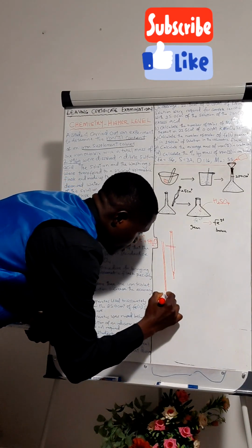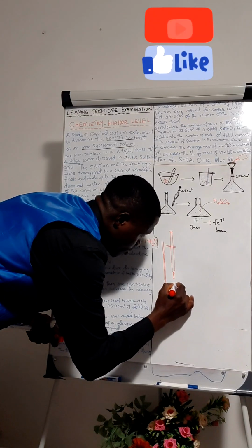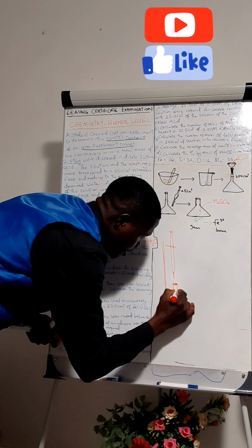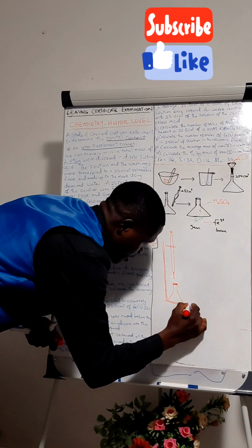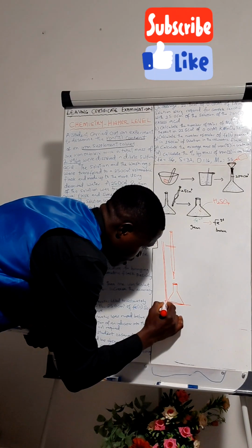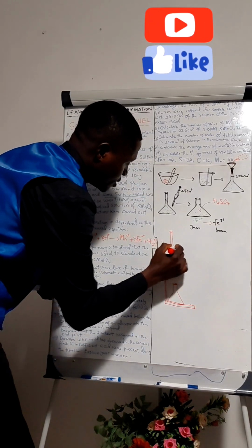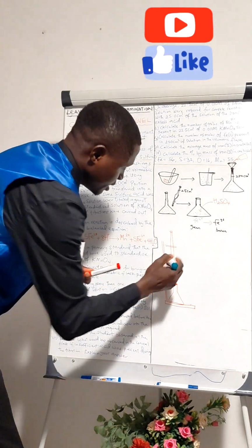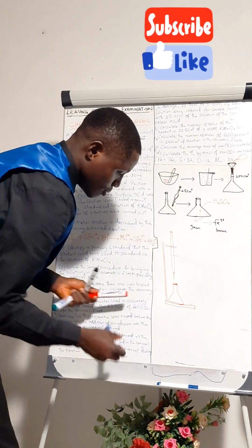And then this solution was brought. And then inside there we have KMnO₄, which is always purple in color.